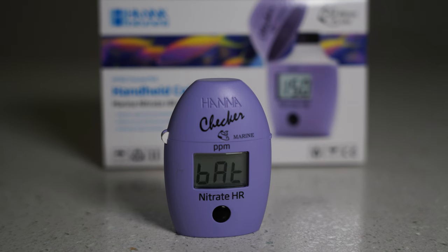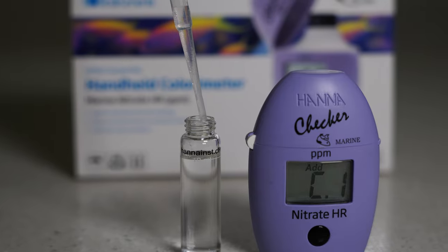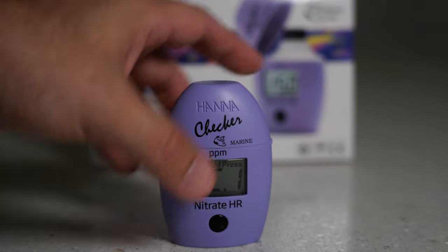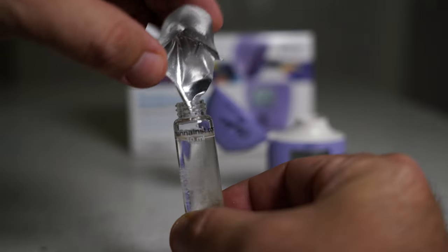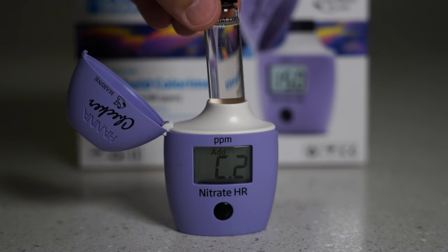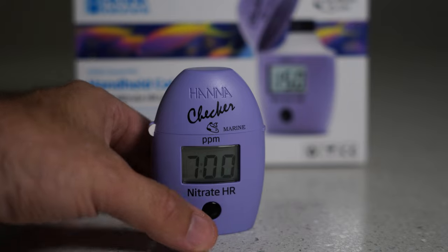To start off, you push the button on the checker while it's empty — that's C1. Then we're gonna fill the vial with 10 milliliters of the saltwater that you're testing. You're looking for the bottom of that curve, also known as the meniscus, to sit at that line on the vial. Put that in the checker and push the button again. Then cut open the packet and put the contents in. Close the cap and keep shaking for two minutes. After those two minutes, put it in the checker again, hold down the button, and you have seven more minutes to go.